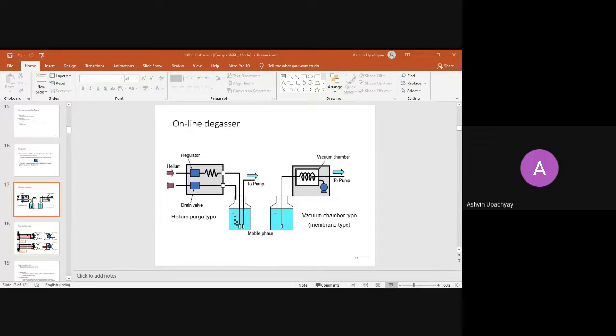After the pump, the column is the most key area for the separation, because at room temperature some analytes may have a problem eluting properly and give a noisy baseline, tailing or fronting of the peak, which may cause actual quantitation problems. To avoid this, the column oven is established for routine use, and you may raise the temperature up to 60 degrees, then all the analytes will get properly resolved.